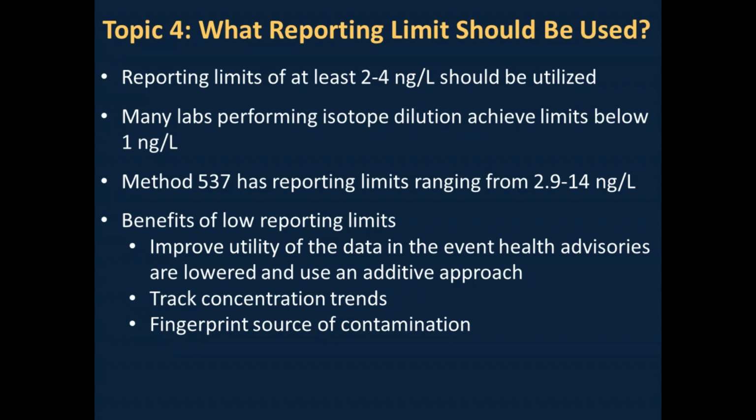And if you have a regulatory standard or advisory value based on an additive formula, you would have these lower levels detected and added into the results.